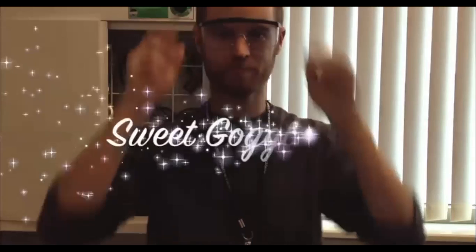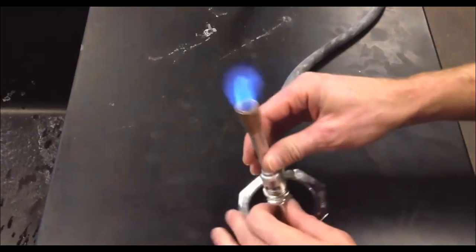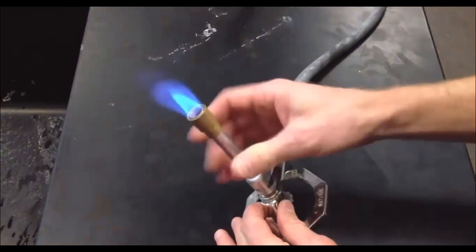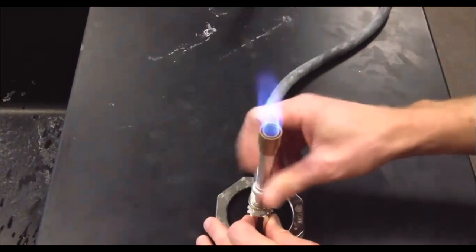So this flame looks pretty good, but I'm going to show you how to make a couple adjustments in case it doesn't look so good when you first turn it on. First of all, I'll show you that there's two adjustable things you can do. One is that you can turn this, and by turning that, it's going to reduce or increase the amount of oxygen that's going into this thing.